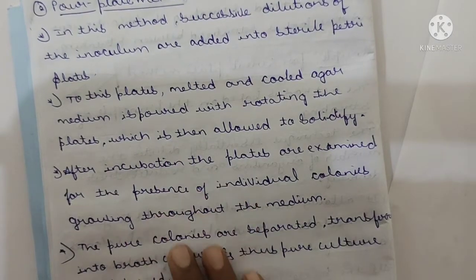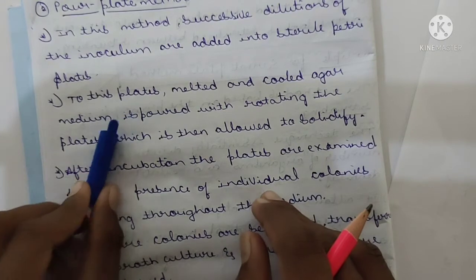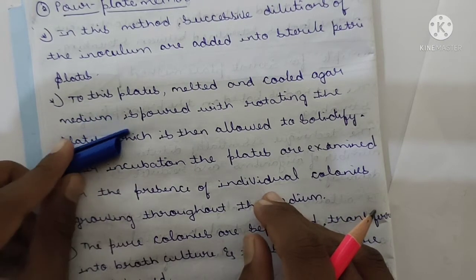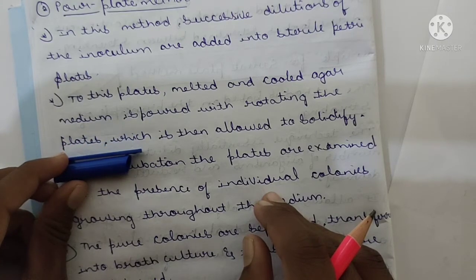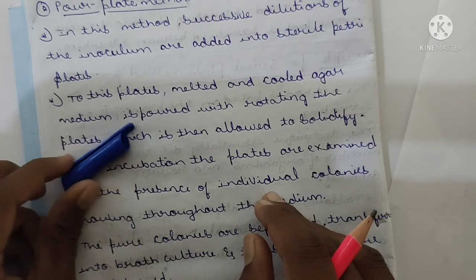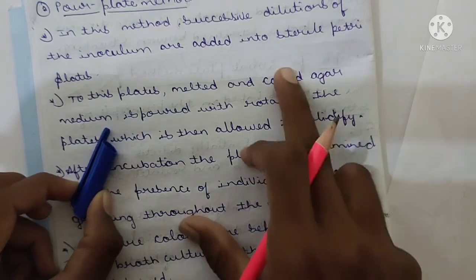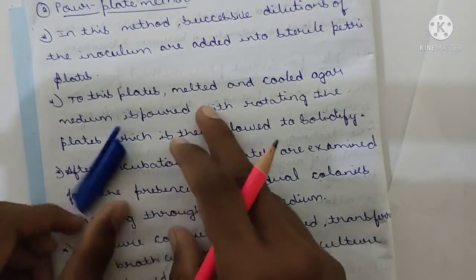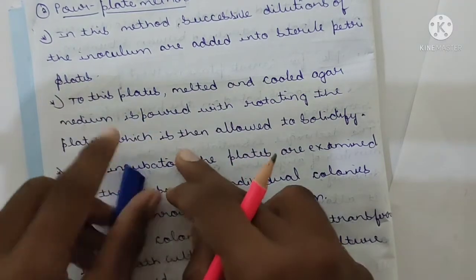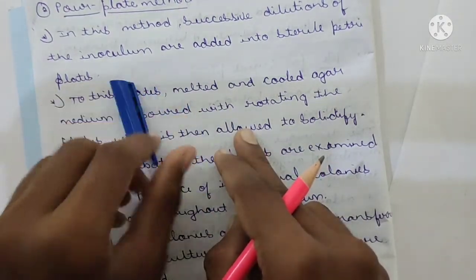For an example, I will give you a better example, don't worry. See here, this is a sterile petri plate. Melted and cooled agar medium is poured with the plate rotating. To this plate what are we adding? We are adding the cooled agar medium with the rotating plate. It is rotating because we are fixing a motor there. It starts rotating. While it is rotating, it contains agar medium.